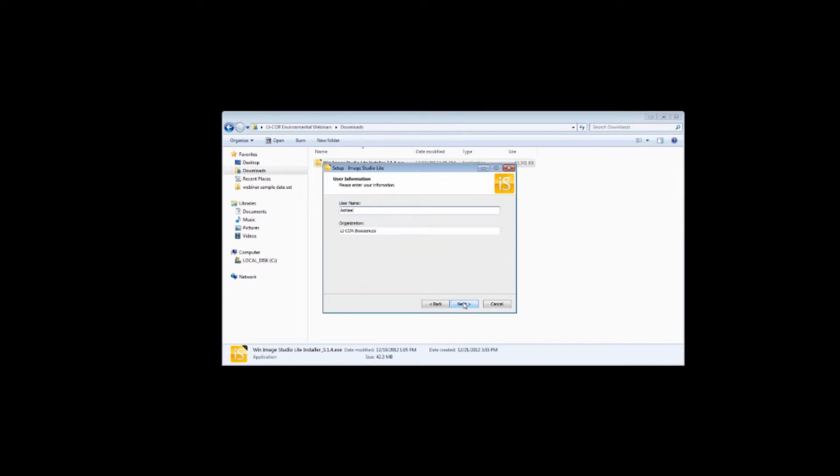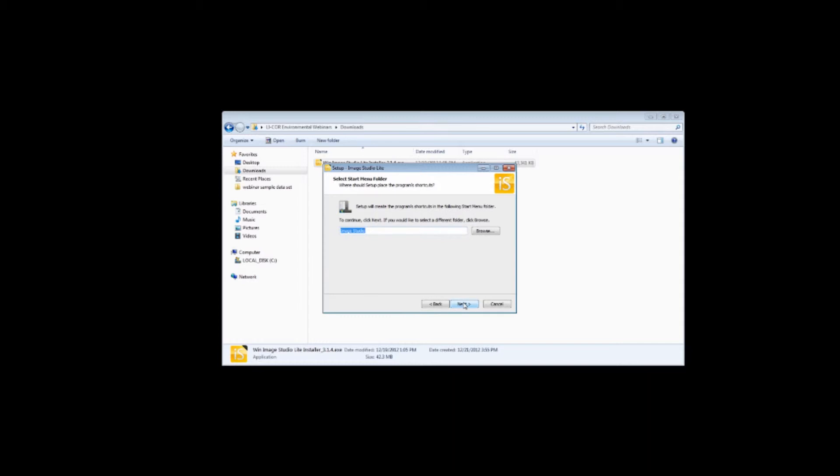Finish clicking through the prompts one at a time, changing any parameters you wish, then finally click Install.